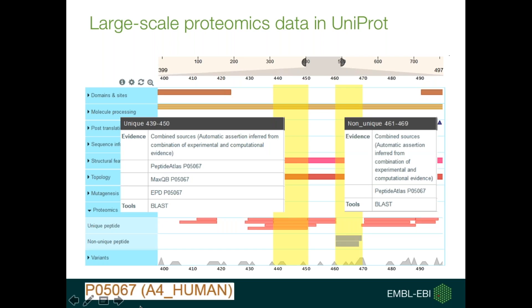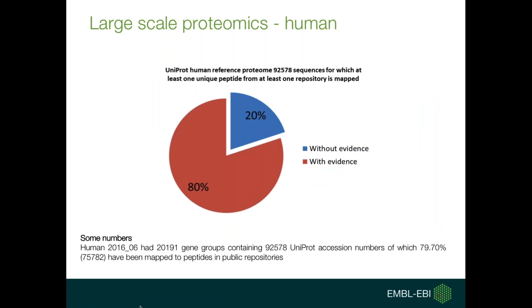Clicking on such a peptide opens a pop-up that tells you that three different resources — Peptide Atlas, MaxQB, and EPD — have experimental proof that this peptide was actually seen in experiments submitted by other researchers. On the contrary, the non-unique peptides would not allow you to identify A4 human in a set of proteins with confidence, because there's at least one other human sequence that has that same peptide. So this view can be useful in a small-scale approach to identify signature peptides that allow identifying any given sequence with confidence.